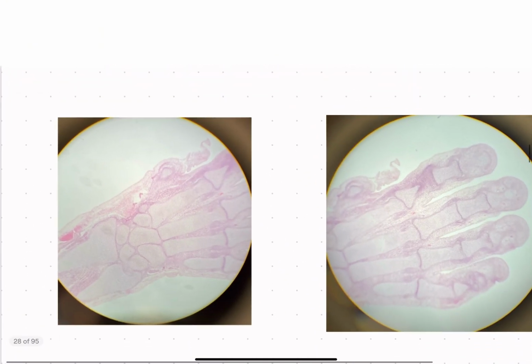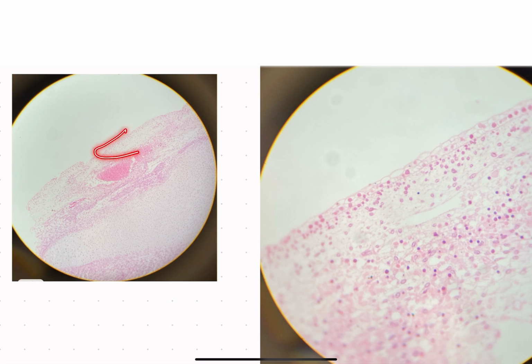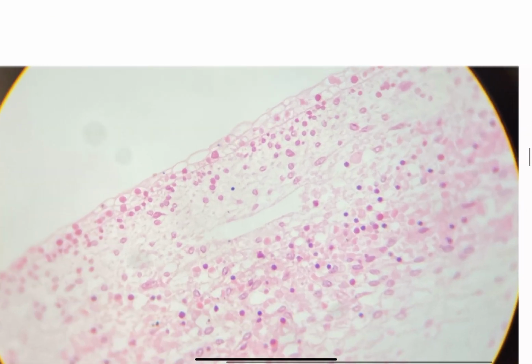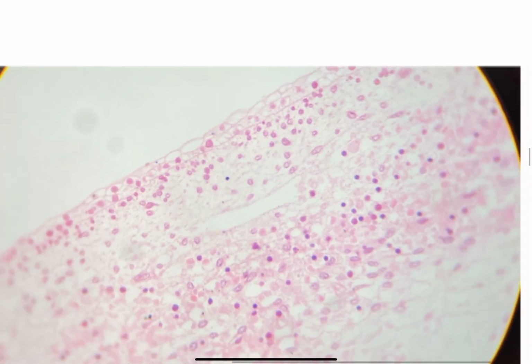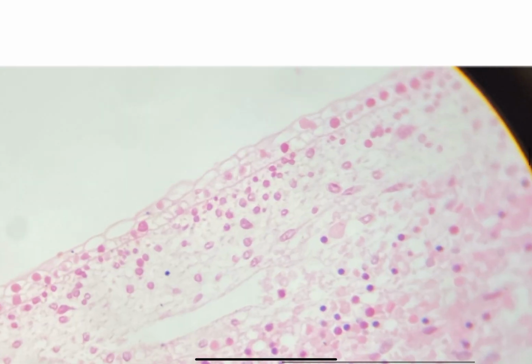Next up is the developing hand, and once zoomed in, we see something like this. So that would be the hypodermis and epidermis. Here, hypodermis region, epidermis region, dermis region. And here we can't actually see the lymphatic vessels super clearly. We do see a blood vessel here because that looks like it has blood cells in it. But we do see an apoptotic and fairly large periderm cell right at the top of the epidermis.